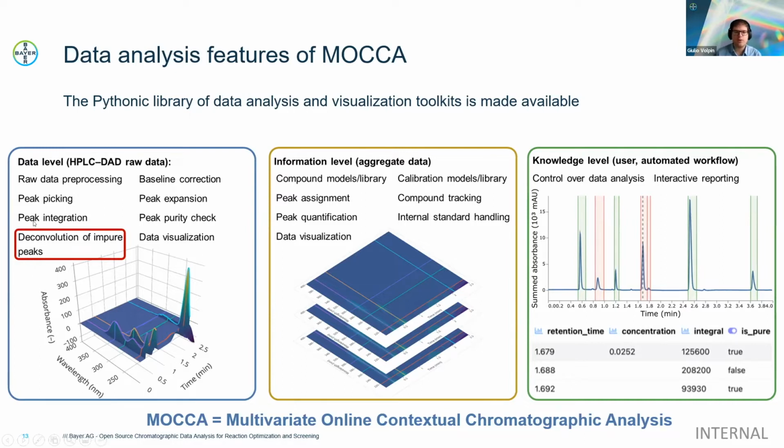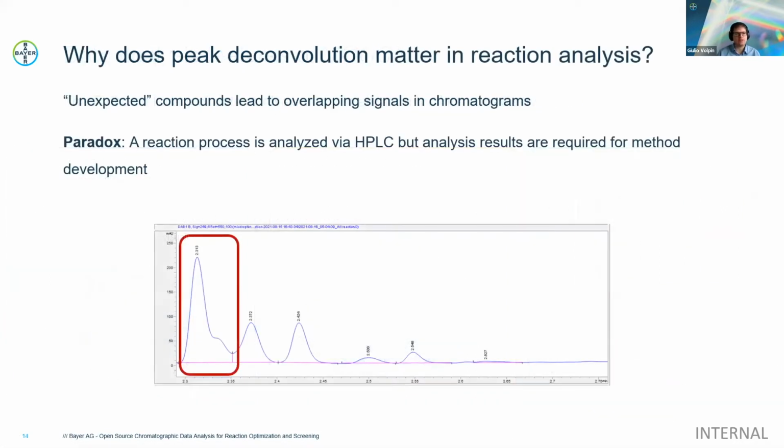And this is especially important for all types of parallel reaction screening and optimization that you do, where you have a semi-standardized workflow that aims to capture most of the chemistry that you're about to do in your lab or in your automated platform. What this usually means is that you have 1 or 2 standard methods to analyze your reaction outcome.